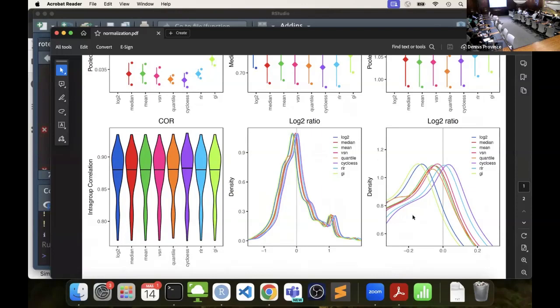Ideally, this data set does not look nearly as clean as what most of them are going to look like. This one's got some humps here. It's got some different populations of proteins here.